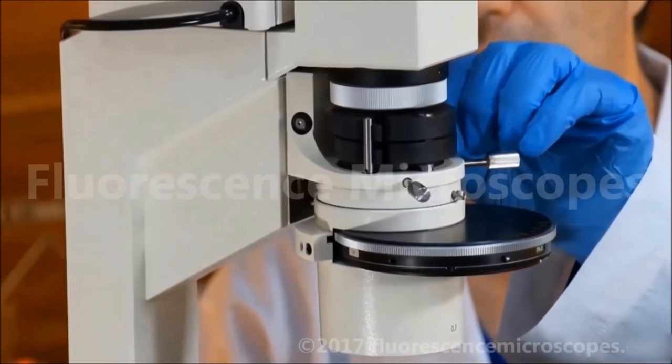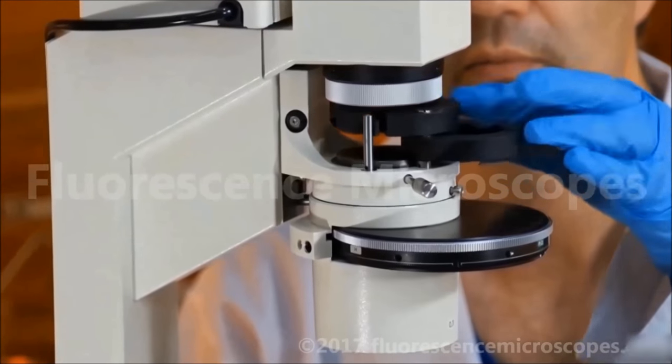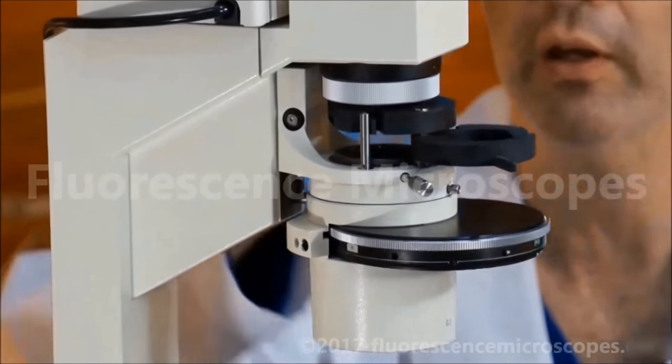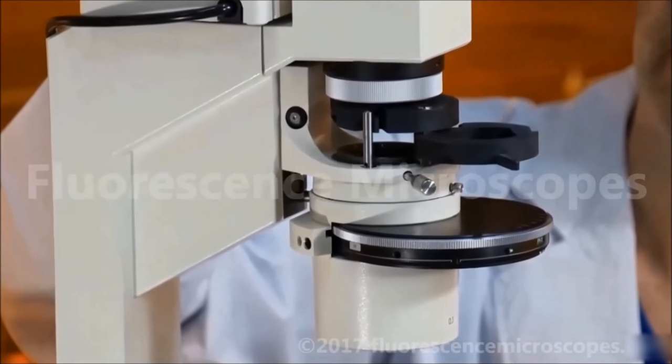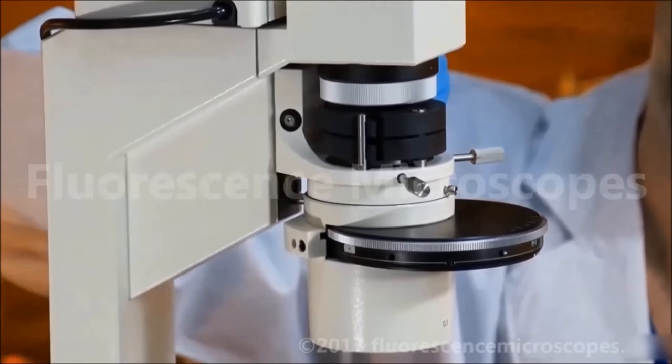And we have a filter installed, daylight filter that's to compensate for the halogen color. Daylight blue.